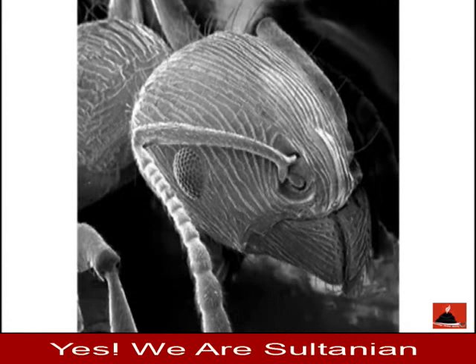What's the deal with when we say an electron micrograph? Well, think about it. It's just like a photograph. So an electron micrograph is a picture taken using, instead of photo light, electrons as the radiation source to capture that. So an electron micrograph is the picture that's produced. An electron microscope is what you're using to produce that image.